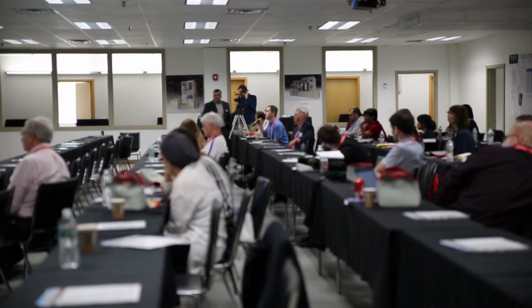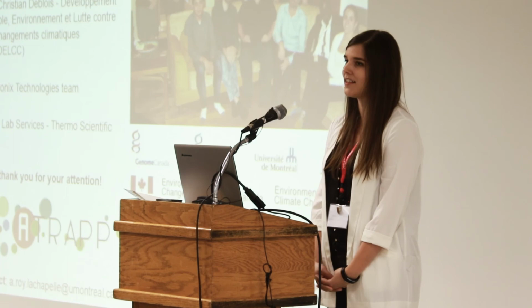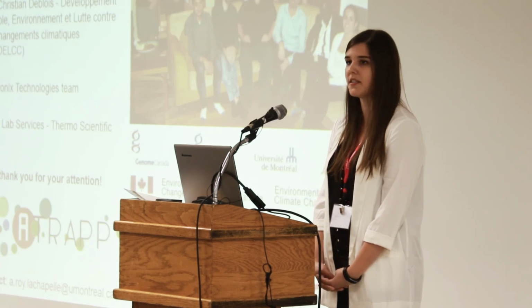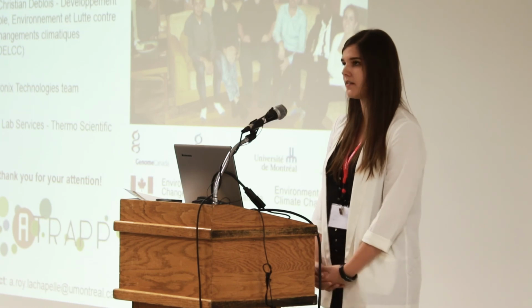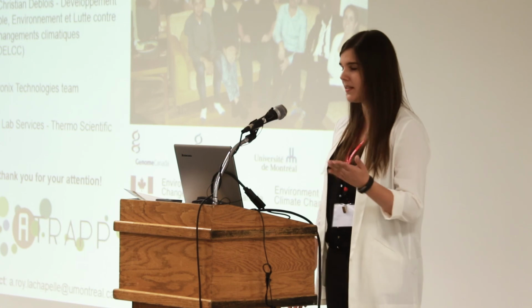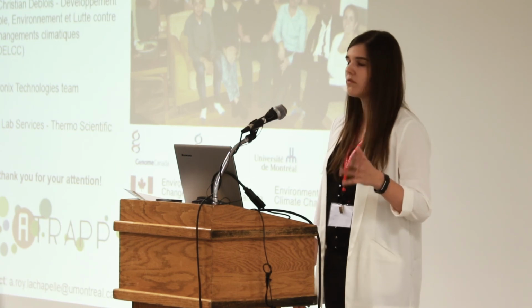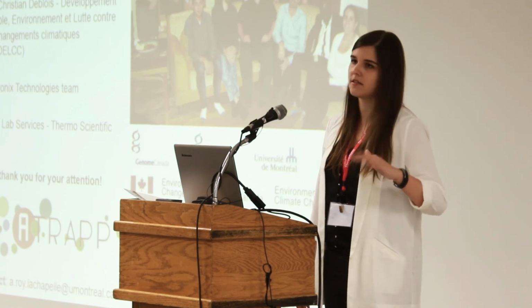And you have no trouble with Anatoxin, or you can do BMAA as well? No, not for this one. That's why we want to work with HILIC, and we didn't really try it yet because we have to get the online SPE for this. But no, the Anatoxin-a works really well, I've got to say. But when we go to more polar toxins, it doesn't work at all.